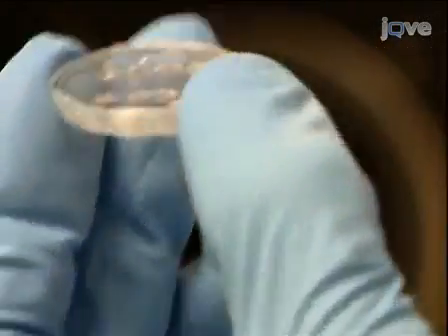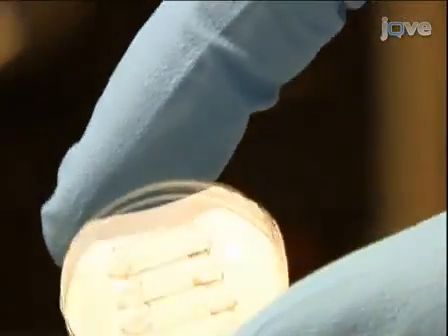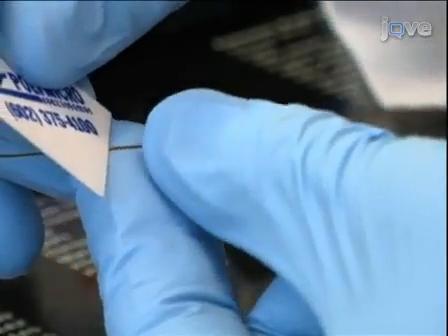The glass window contains 8 2 mm holes at both ends of the channels, which were previously drilled. Next, a 2-inch long flexible fused silica capillary tubing is inserted through each glass window hole.